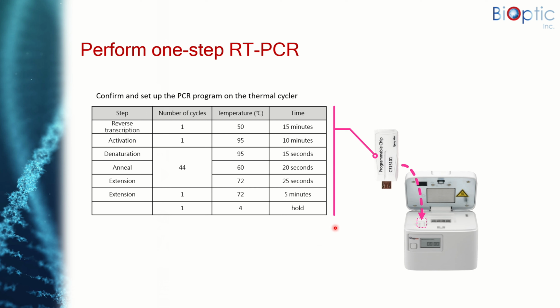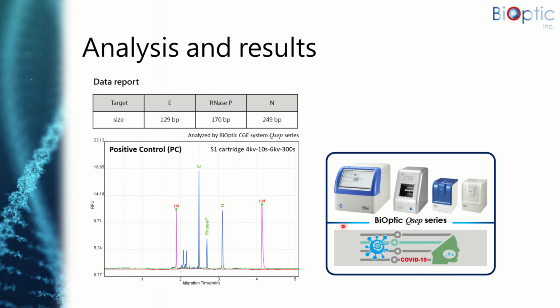And this is the reverse transcription PCR program. After RT-PCR finishes, just take out the tube and place it in the capillary electrophoresis.